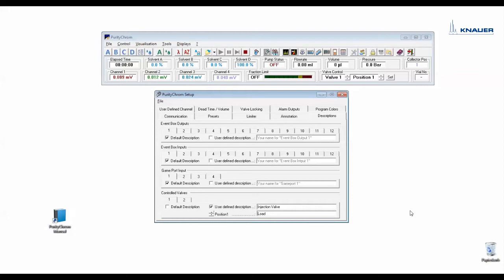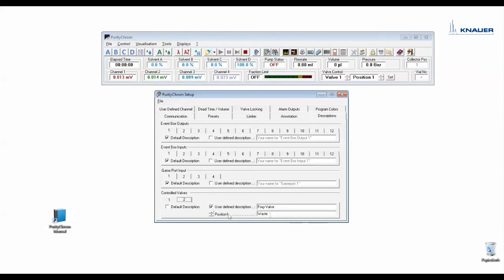In descriptions you can give your valves user defined names. First valve we have named injection valve with the position load and inject and the second valve foxy valve with the position waste and fraction.